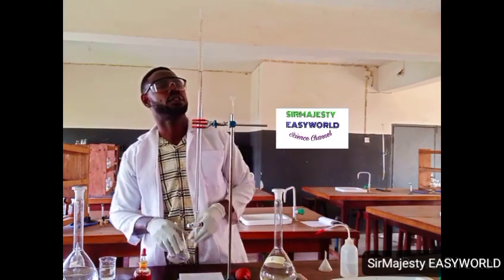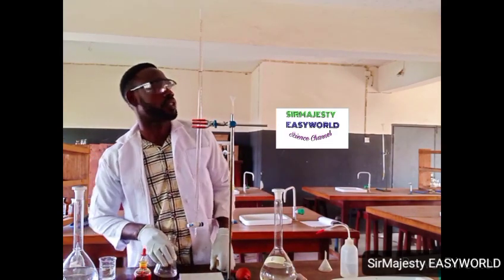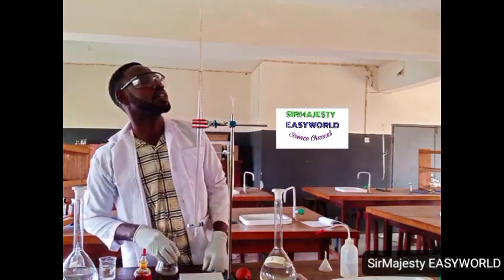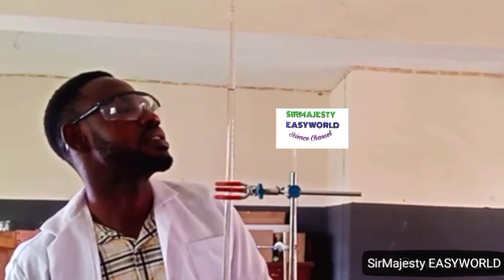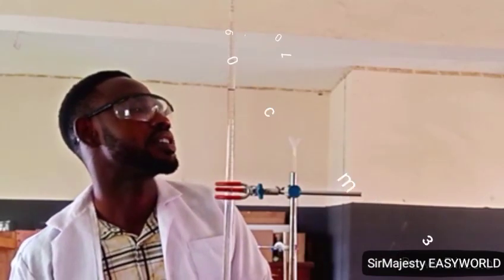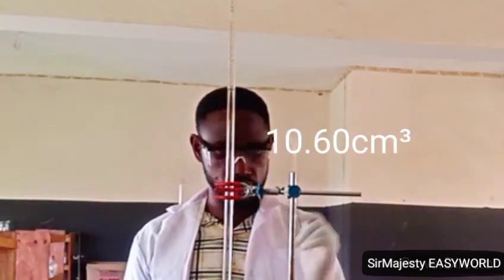So we have gotten the endpoint. Yeah, this is colorless now. We have 10.6. This is 10.6 with phenolphthalein, 10.6.